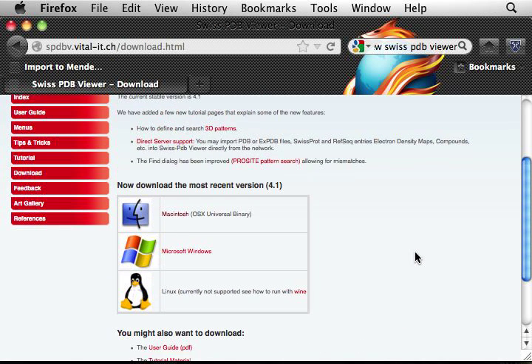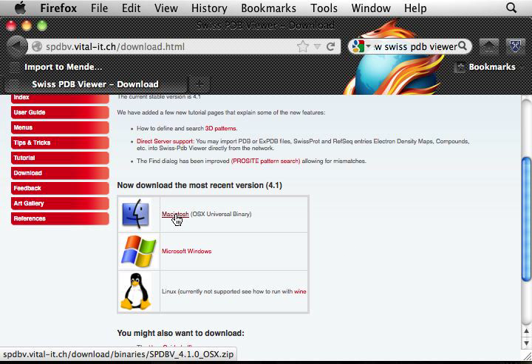And then you have to choose the platform, computer platform. So here I use a Mac, so I'm going to download the Mac version.